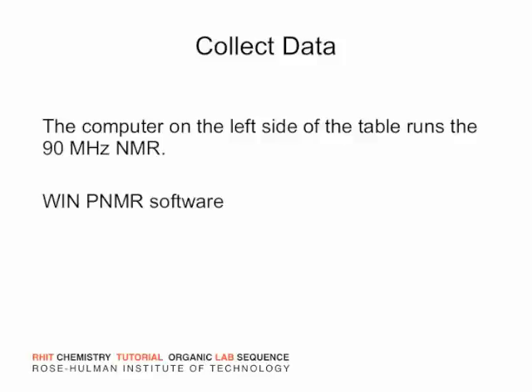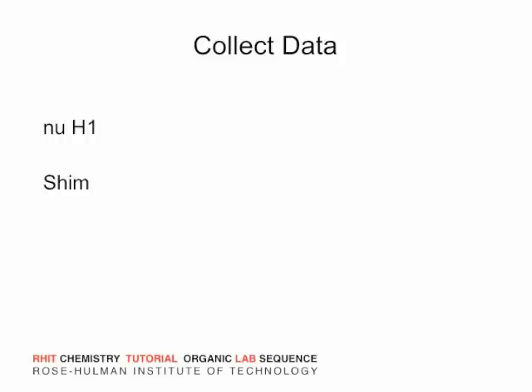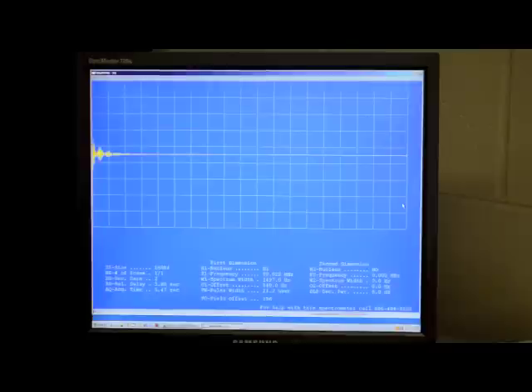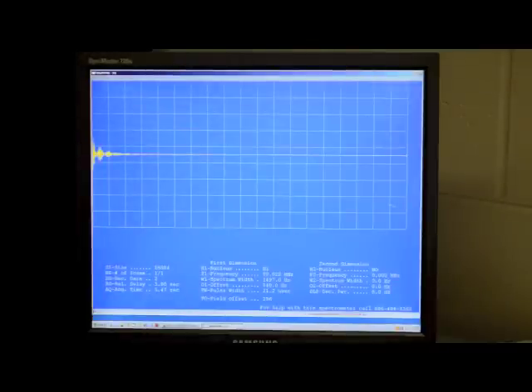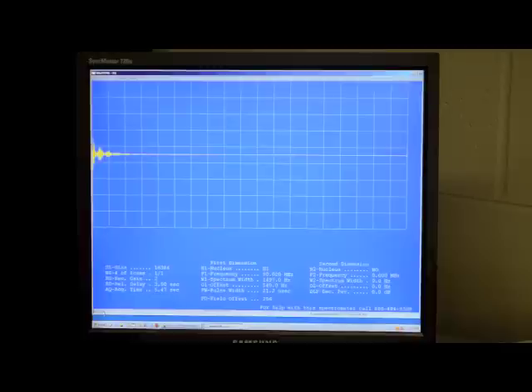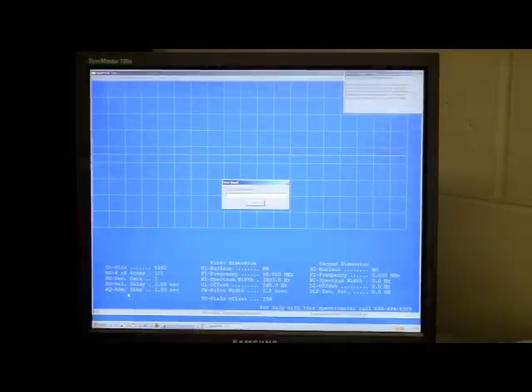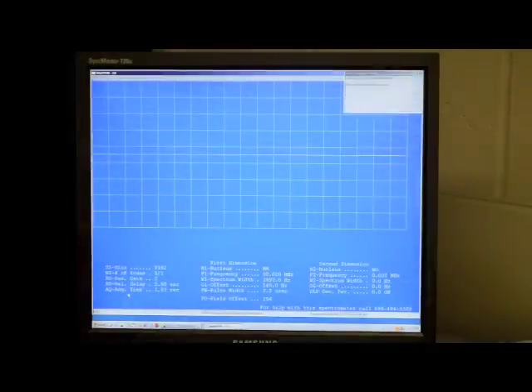Go to the computer and switch to the WinPNMR software used to collect data. You should see the H1 and a prompt at the bottom left of the blue window. Type SHIM and press ENTER. Type 5 for the relaxation delay and press ENTER again.